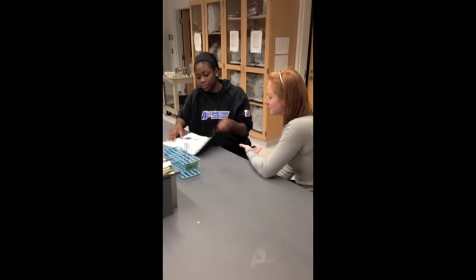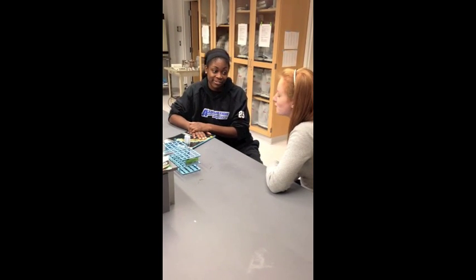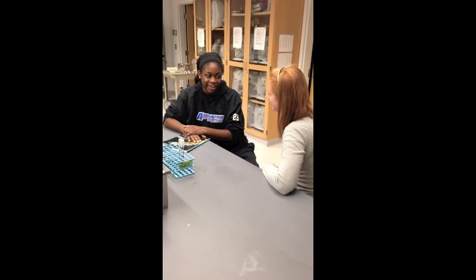Thanks so much for showing me how to do this. I never knew that microbiology was so interesting. No problem. Hopefully next time you can do the test on your own. For sure, thanks for teaching me everything.